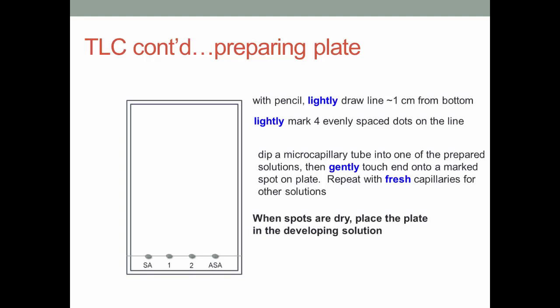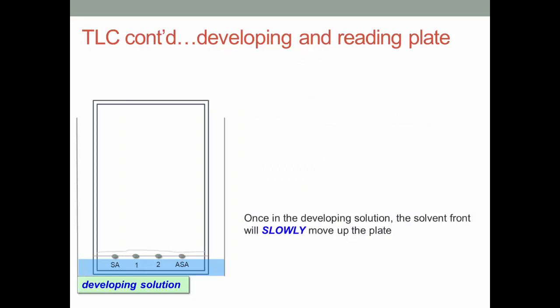When the spots are dry, you can place the plate in the developing solution. Once in the solution, the solvent front will move slowly up the plate. Much slower than is shown.